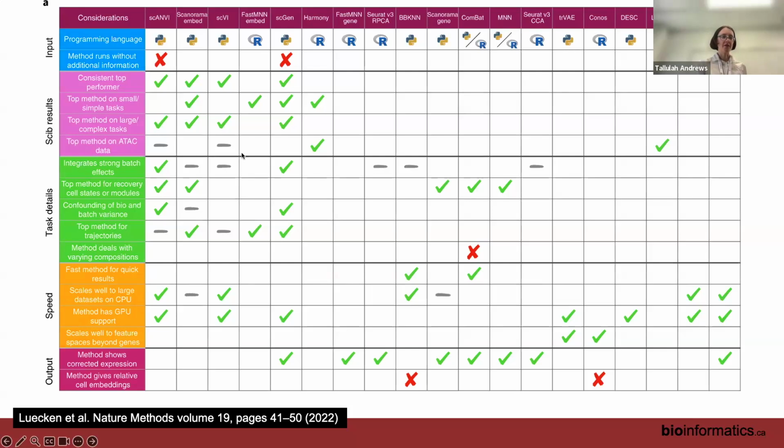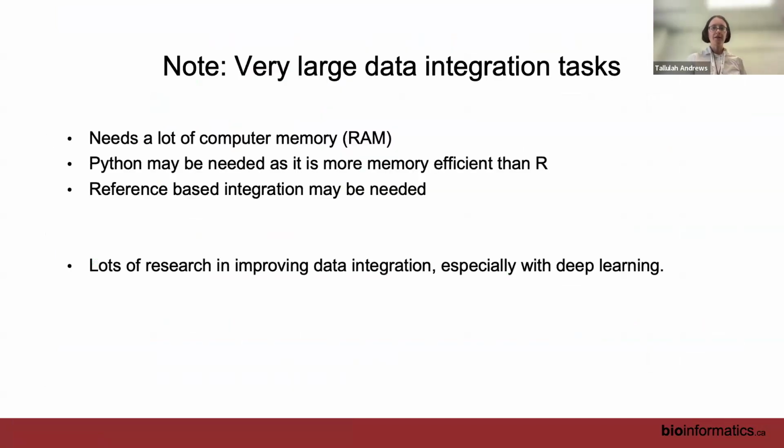I'm sure that has nothing to do with the fact that this whole lab that published this method is like, yes, everyone needs to switch to Python right now. And they run a whole set of workshops for, yes, here's how you do single-cell RNA-seq analysis in Python. So if you want to learn how to do it, that's the group you want to look up. They have lots of tutorials for working in Python. They are Python advocates.